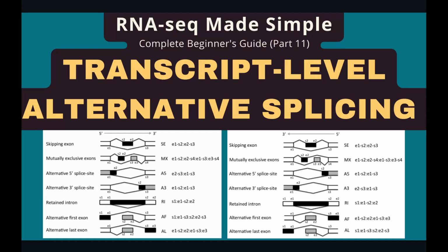Previously, I showed you how to perform alternative splicing analysis. In this video, I'm going to show you how to perform transcript-level alternative splicing analysis. The title is a bit misleading though. There's no transcript-level or gene-level alternative splicing. It's only used to differentiate the tools I used.